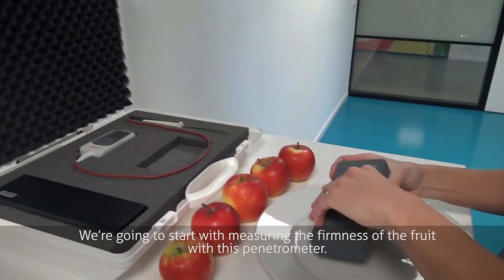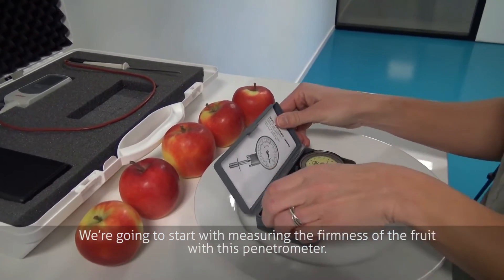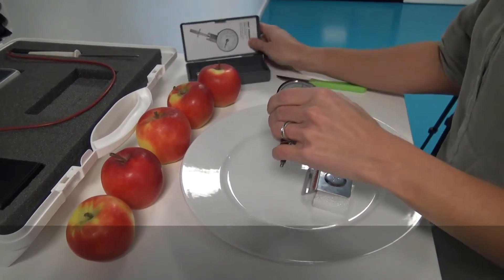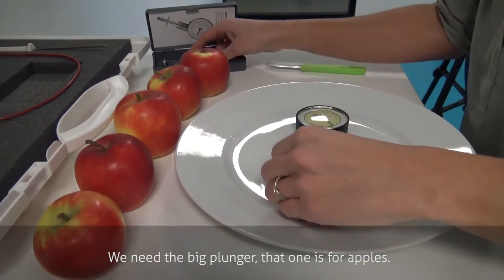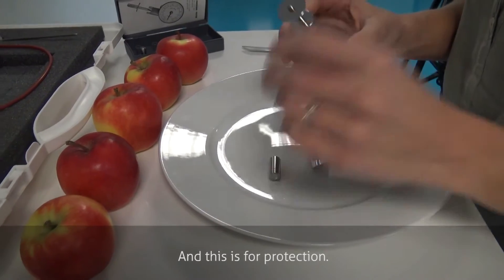We are going to start with measuring the firmness of the fruit with this penetrometer. We need the big plunger — that one is for apples. This is for protection.